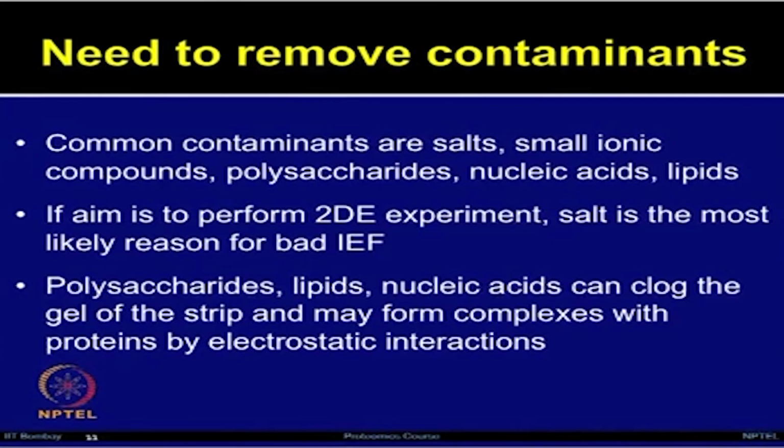There are different types of contaminants which may also affect the quality of your proteomic experiment, such as polysaccharides, lipids, nucleic acids.